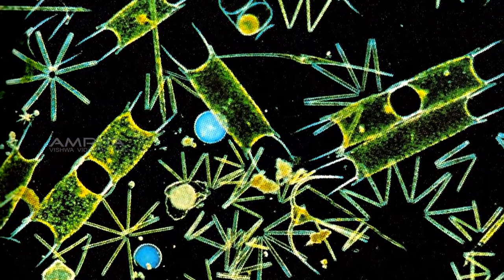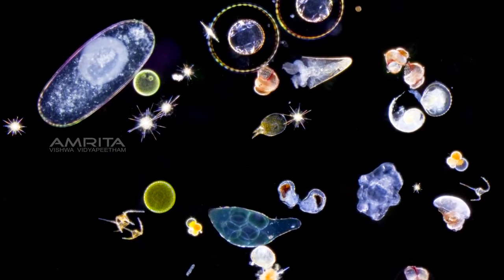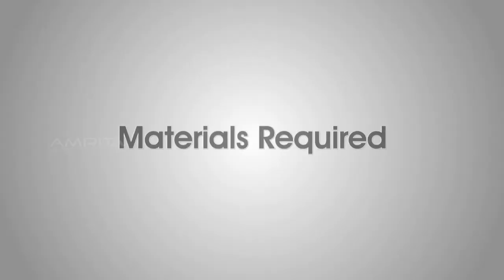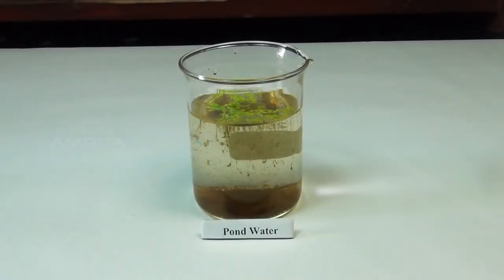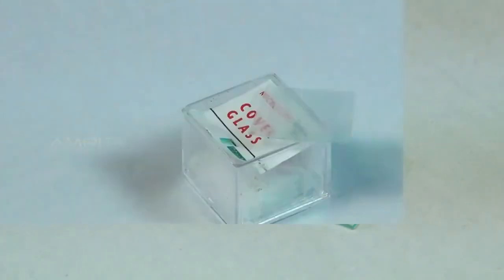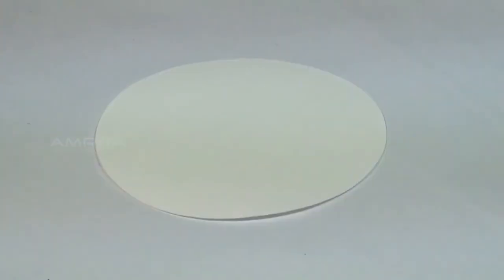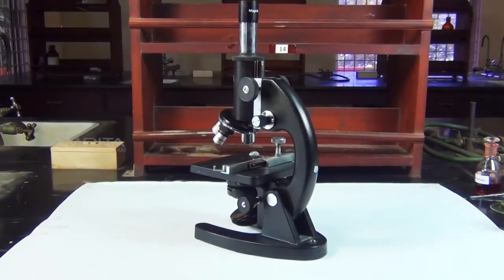You will observe these kinds of living organisms in the water sample with the help of a microscope. Materials required: a water sample from a pond, test tube, glass slide, cover slip, needle, dropper, filter paper and a compound microscope.